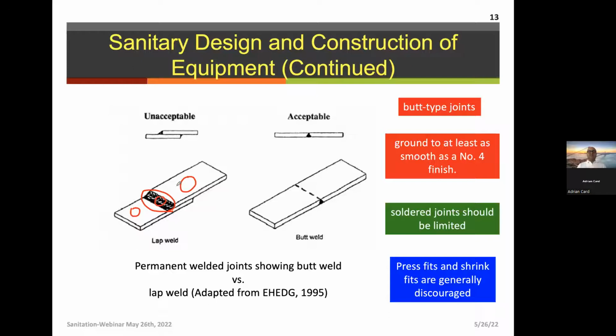So one of the key aspects when we're doing these types of swabbing systems is to be able to validate each area that we're going to swab and to be specific to the area that we're trying to analyze, okay? And again, we're going to get into this a little bit more, but the important part is to have food grade welding to prevent these accumulations that not only are going to allow for biofilm formation, but are also going to interfere in our ability to do a proper assessment of cleaning of a location, especially if you have not defined specifically which areas you need to swab.